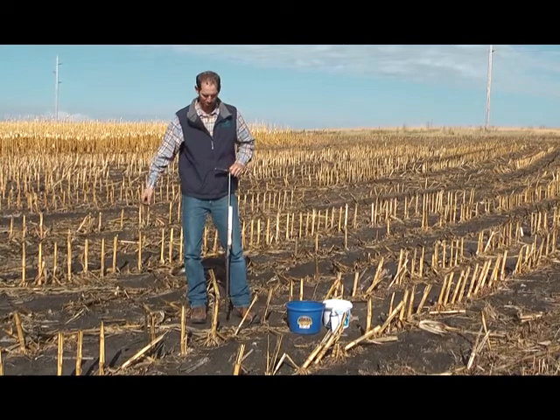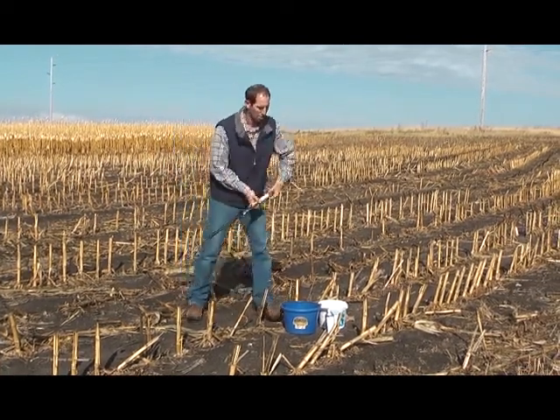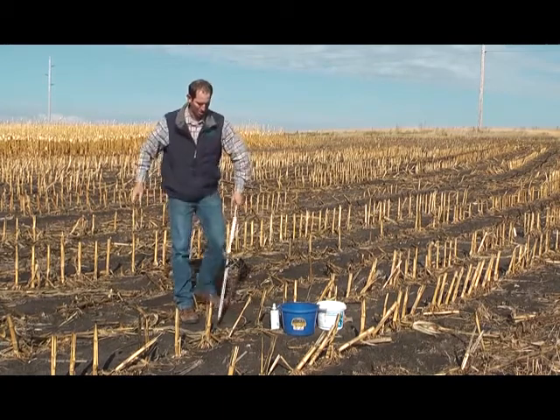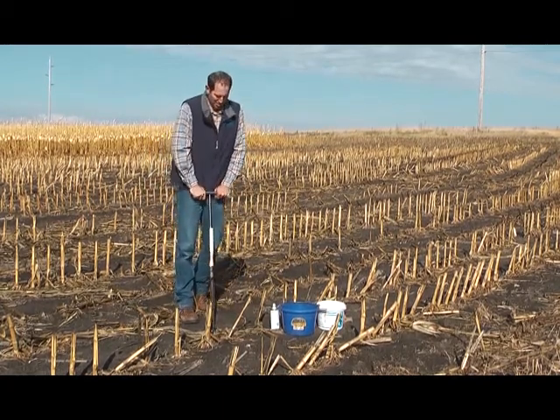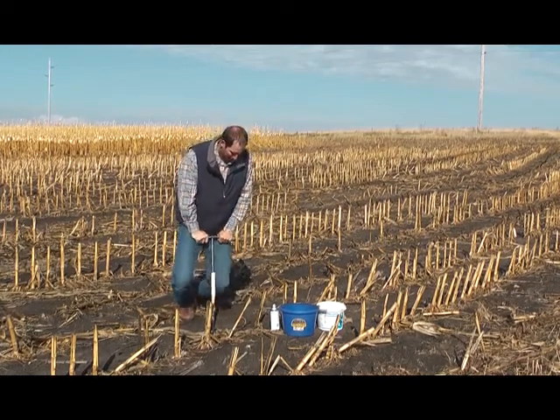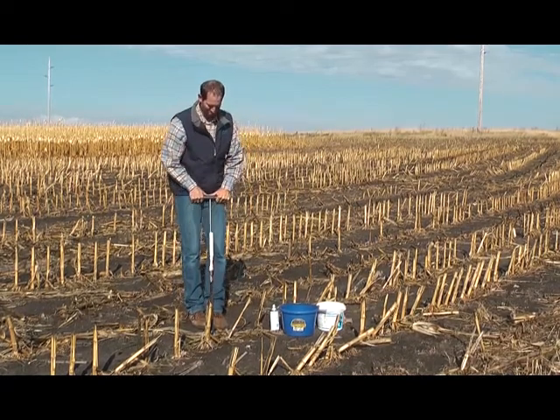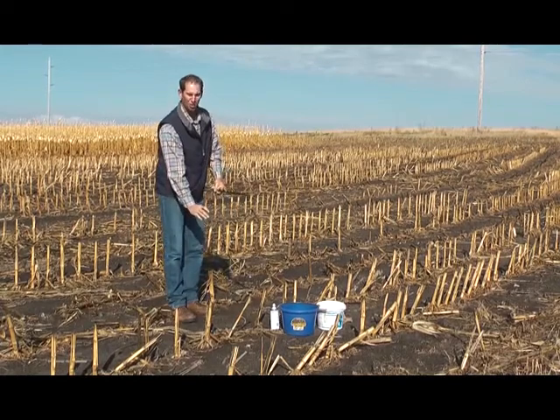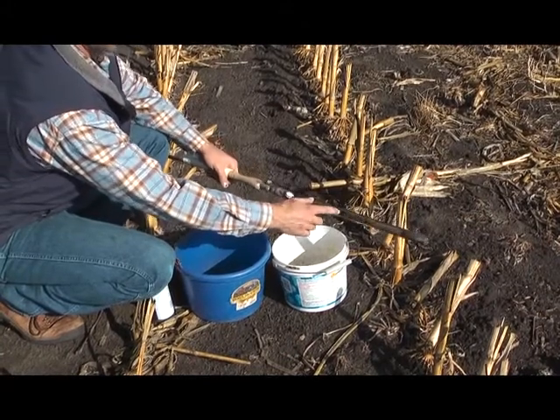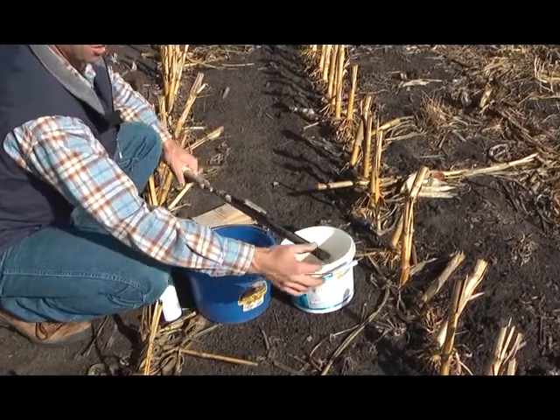We'll try taking a sample here and see if we can get one taken. I'll spray the probe, putting a light layer of WD-40 on front and back. I'm going to try to go down 24 inches. I was very careful to keep the hole exactly there and didn't let any dirt fall in. So I've got my top six inches — my mark is right here — so I'll put that in one bucket.